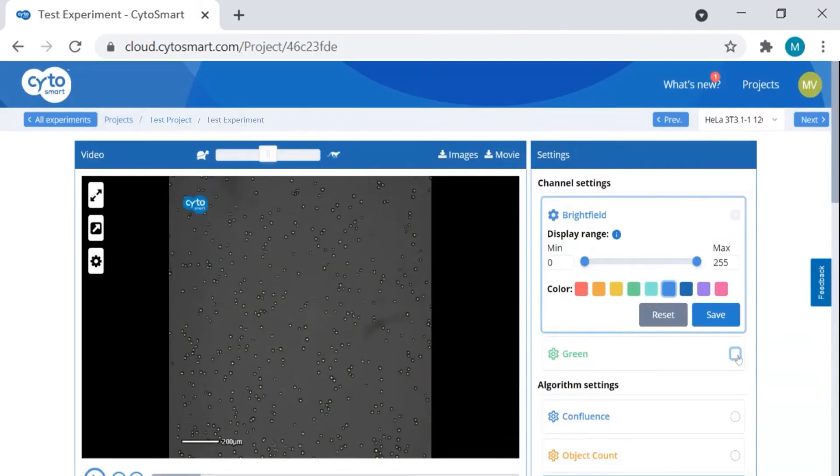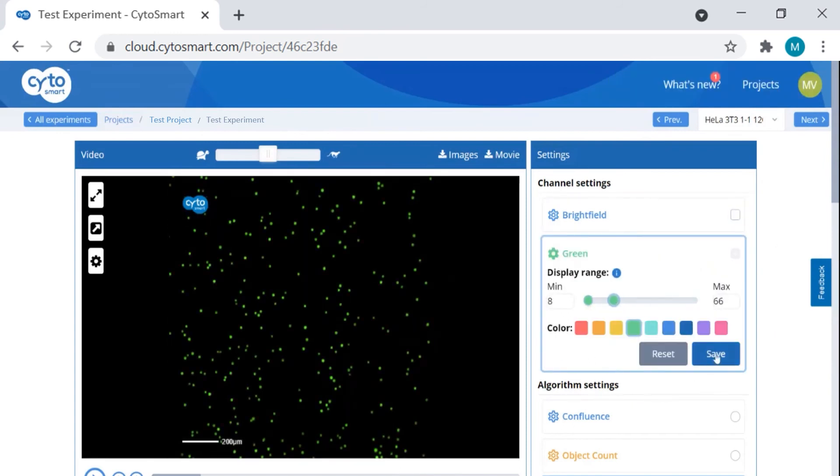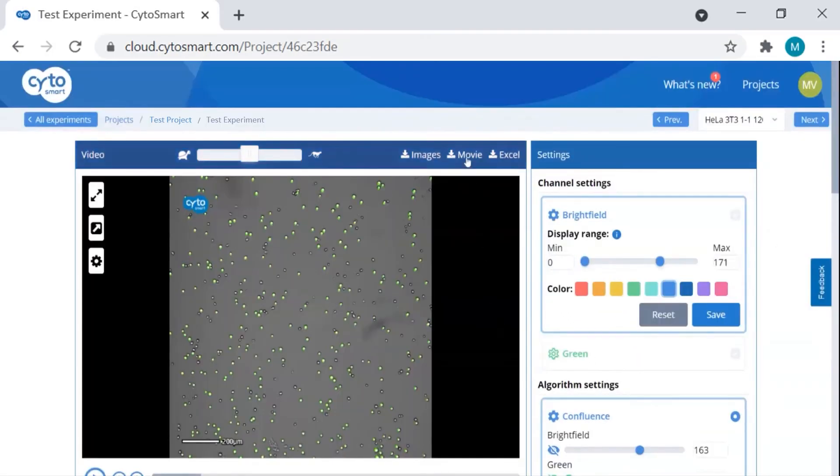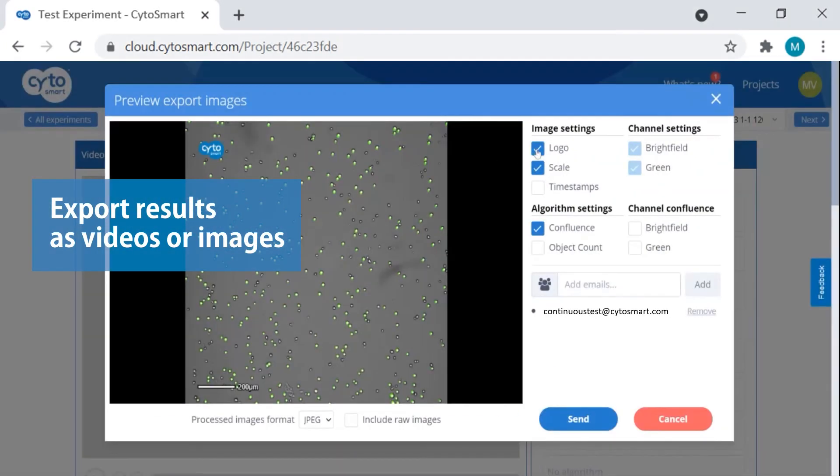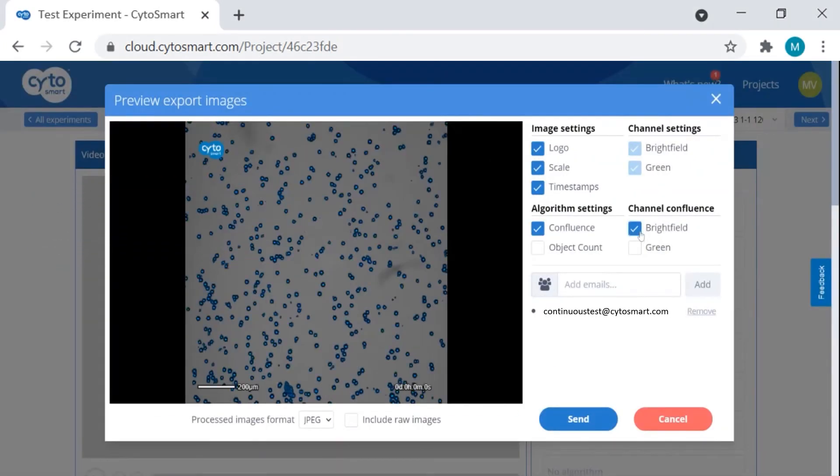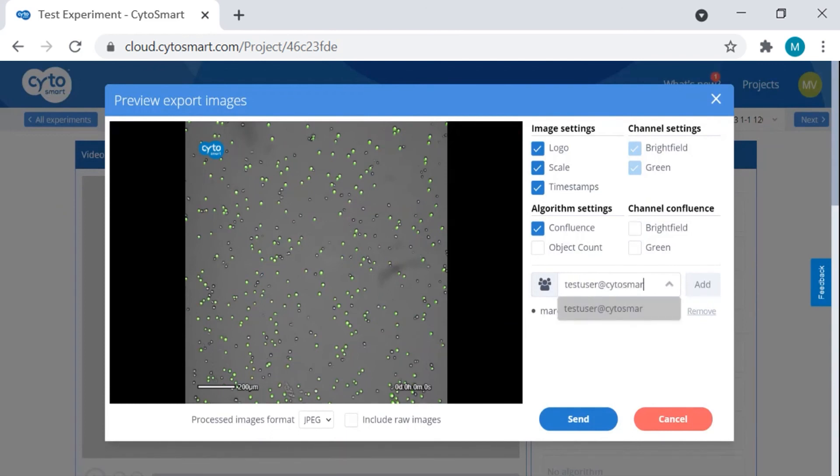After ending your experiment, you can process the images and analysis in the cloud to customize your results. When you're satisfied with your experiment, you can export them as videos or images, which you can adjust to your requirements. Share great results directly with your colleagues.